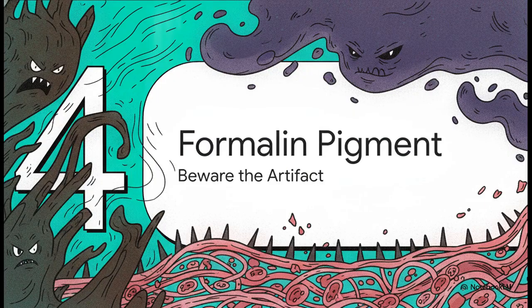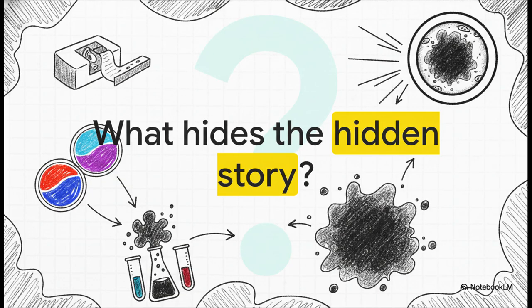Next up is Section 4, beware the formalin pigment. Okay, picture this.